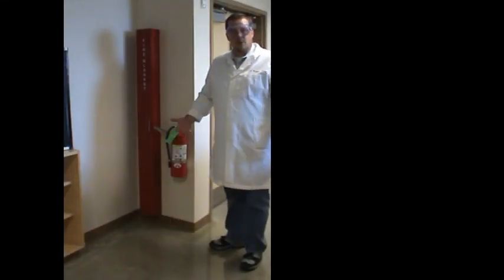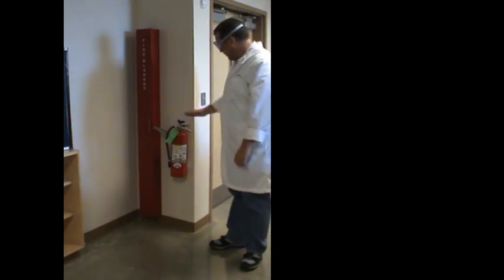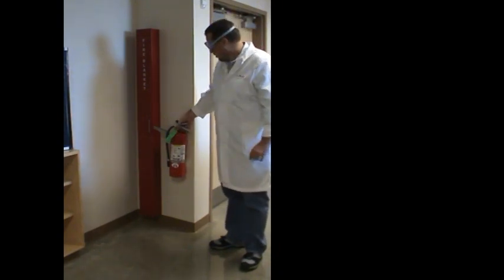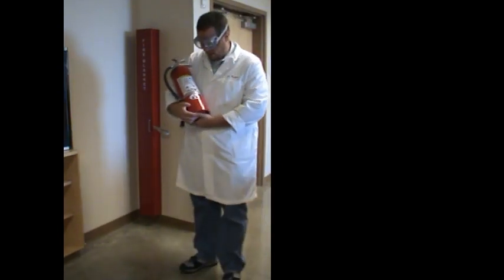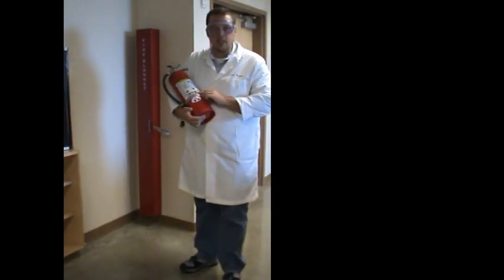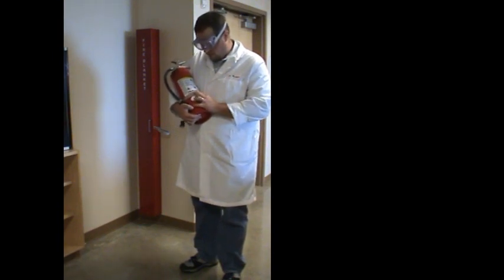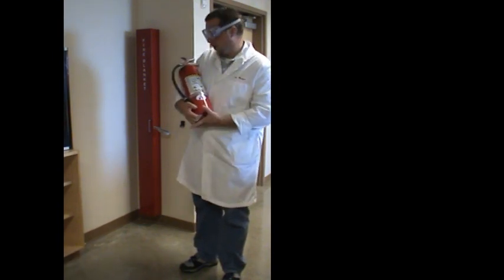Also located in the front of the room are some other fire extinguishing devices. First of all is a fire extinguisher. In our labs, we have fire extinguishers that are type ABC, suitable for paper and woods, liquid fires, and electrical fires.